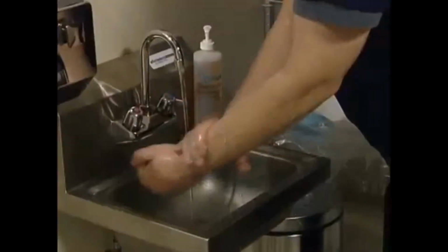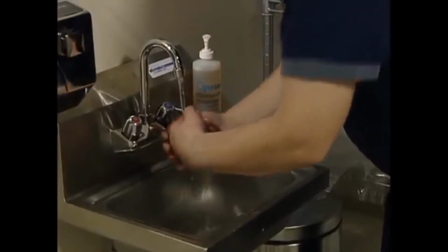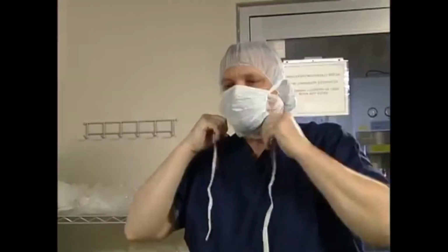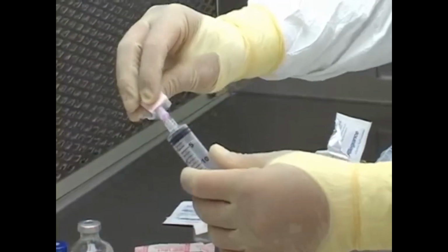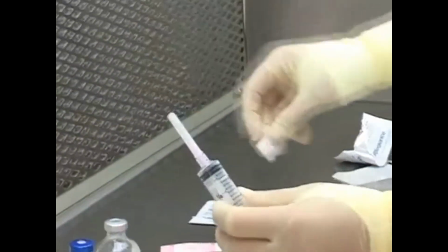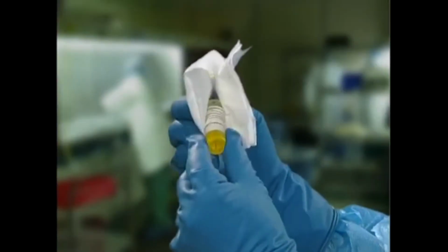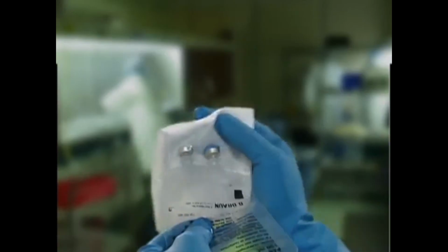Remove all makeup and jewelry from your hands and wrists. Be sure to wash your hands and arms before entering the hood. Wear appropriate personal protective equipment such as gloves, gowns, masks, and hair, eye, beard, and shoe covers. Keep your hands within the cleaned area of the hood as much as possible. Do not touch your hair, face, or clothing. Remove excess dust from items before introducing them into the compounding work area, and perform all calculations before entering the hood.